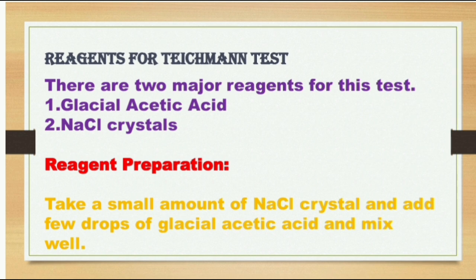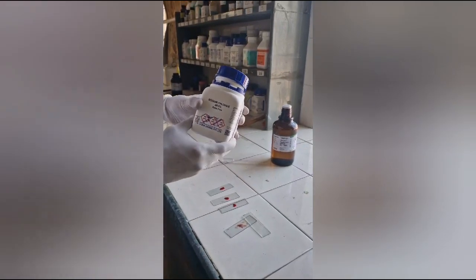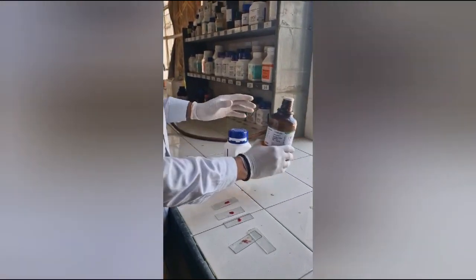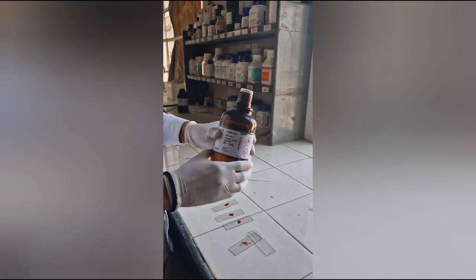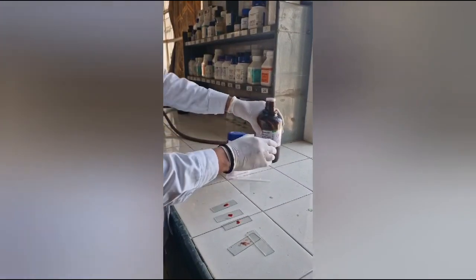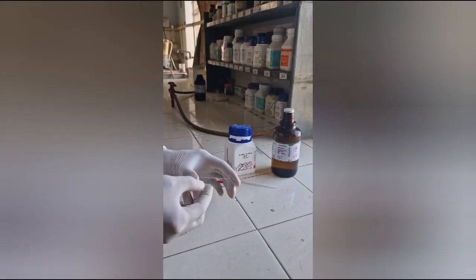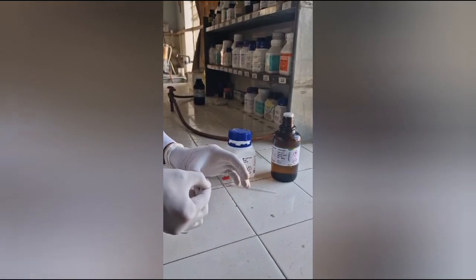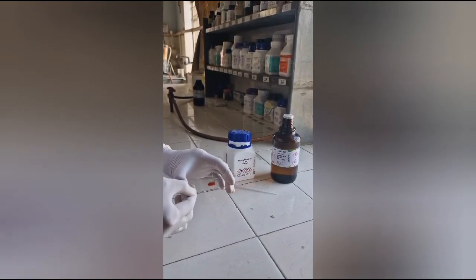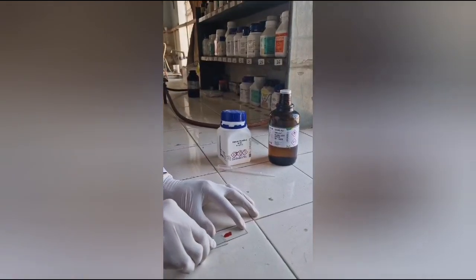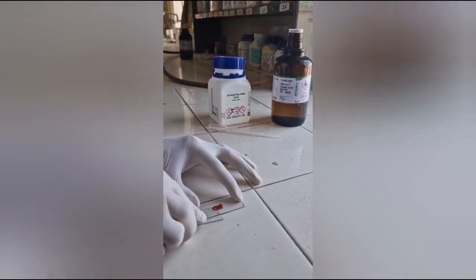Now I will show you the step-by-step procedure and result of this test. For this experiment we need two reagents: first is sodium chloride and second is glacial acetic acid. Here we have taken a blood sample and dried it for at least 10 to 15 minutes. After drying, we scratch it and make it into a powdery form.